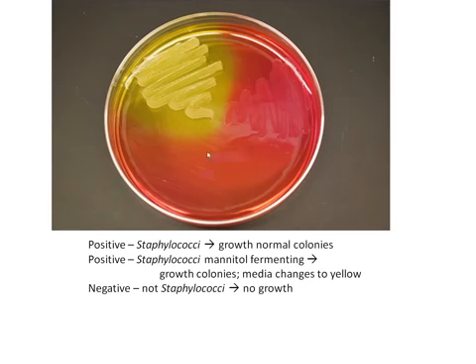On the bottom plate here, this is an area where bacteria were added and no growth occurred. No growth tells us that that bacteria is not a halophile. It is definitely not Staphylococcus. Here on the media we can see bacteria has been added and it is growing. Therefore we know this bacteria is a halophile. It is likely a Staphylococcus.